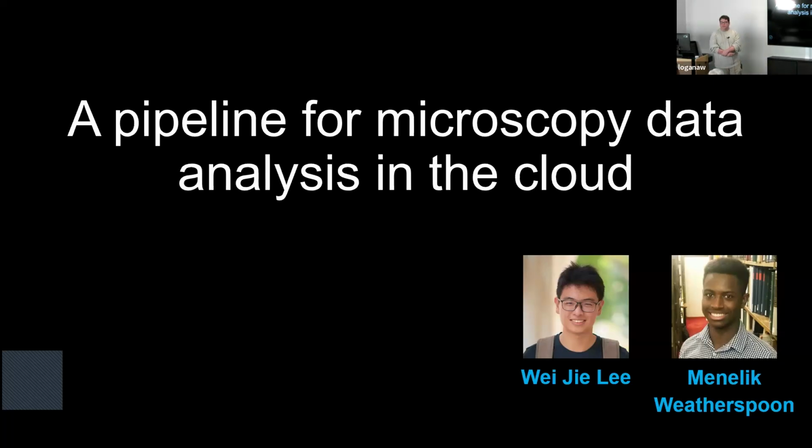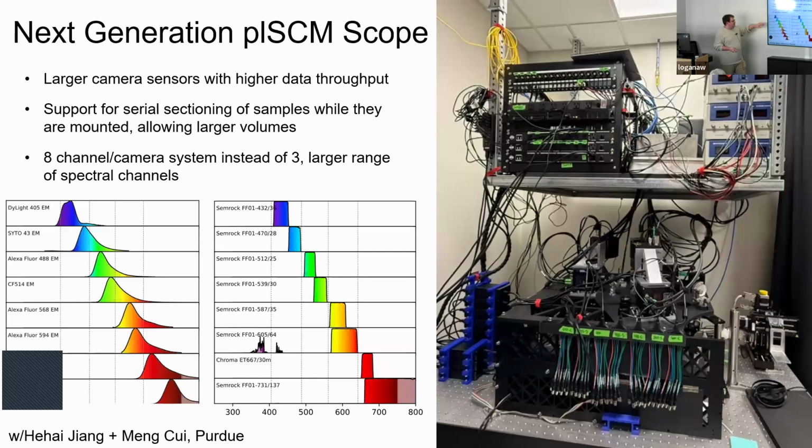For our system, since we're using fixed dichroics and fixed filters, we actually can't change it. If we want to change it, we have to physically unscrew the filters and replace them. But with this system, if you tell me you want to image this, this, and this, you can just turn the other ones off. So effectively, that's how we are able to somewhat select the range, but it's not as easily configurable as a traditional confocal where a lot of them have spectral detectors that can be retuned on the fly. Yeah. Thank you so much.